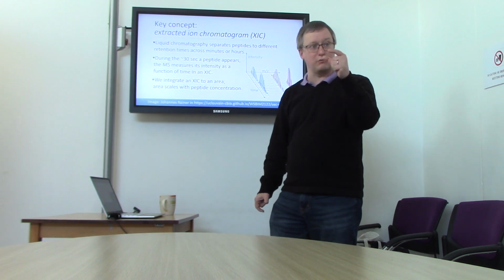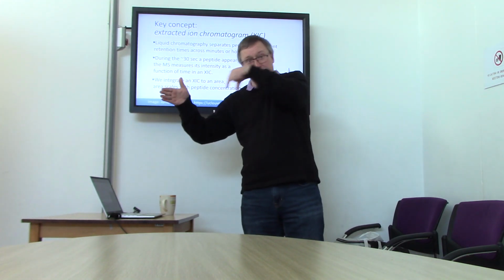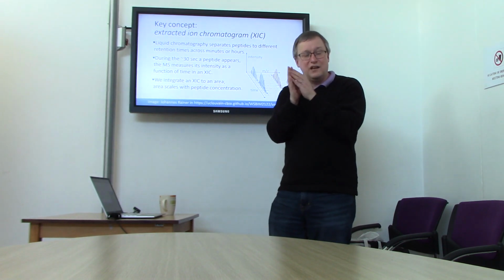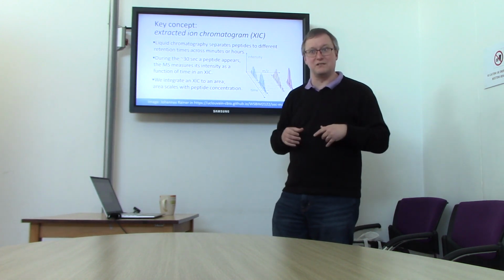across some short range of retention time. Most of our experiments are like 90 minutes long, so a 30-second period within this is what we're zooming in on. We're looking at just a tiny slice of retention time and just a tiny slice of mass to charge in this diagram, but it's useful for understanding this.